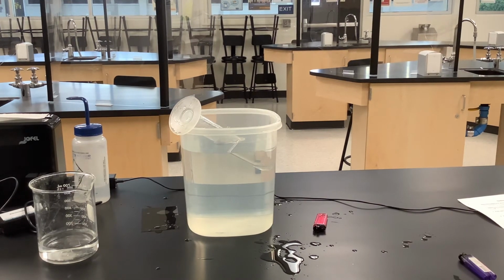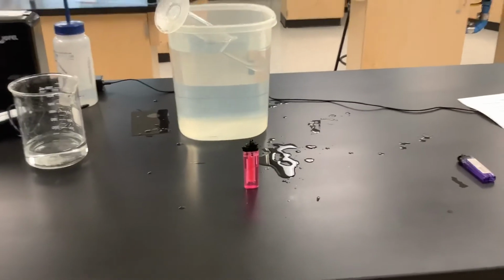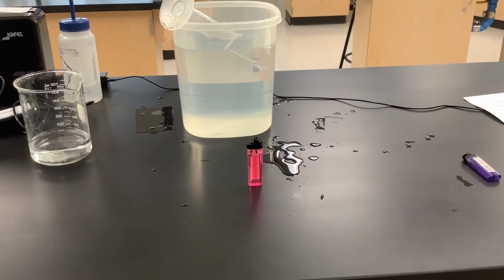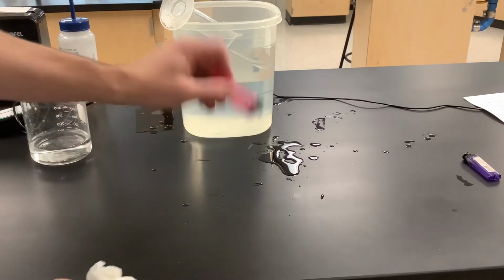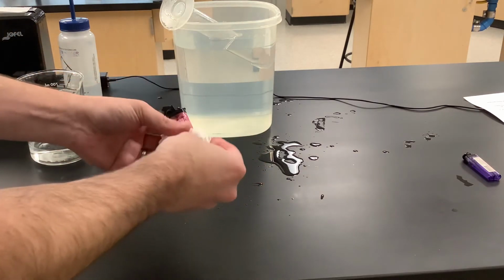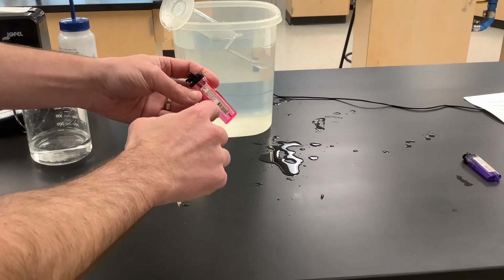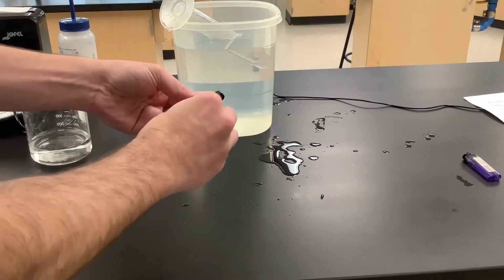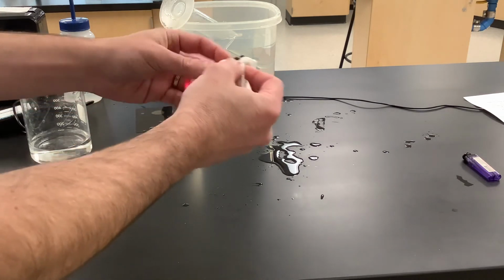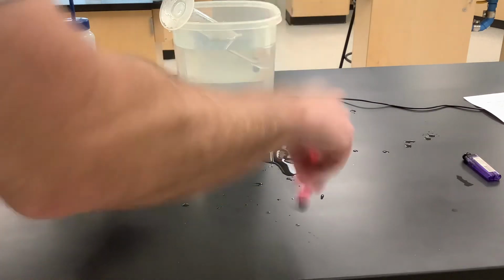So now what we need to do is take our butane lighter and we need to weigh that. We need to try and figure out how much of the butane was used. Now the problem is our lighter is all wet, so we have to try and get this thing as dry as we can. So we're going to dry it off as best we can. There's a little bit that we can't get dry. There's a little bit of moisture that has soaked into the sticker here, but it's not very much, and hopefully it won't create too large of an error. But there really isn't a way for us to get zero error because of that.